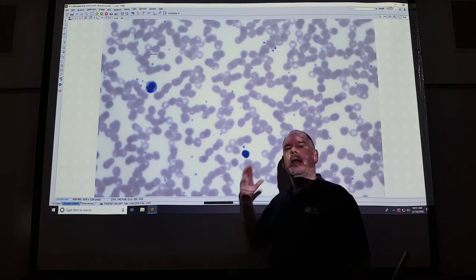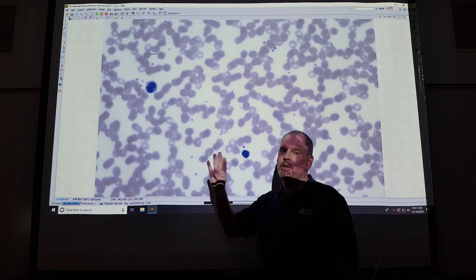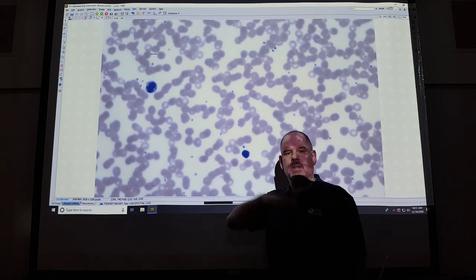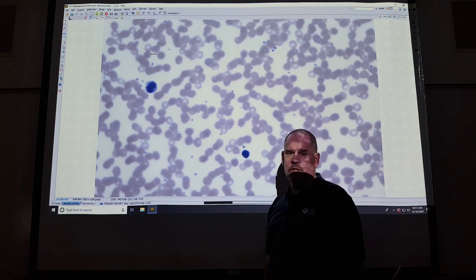Common mistake. I will ask a student, what type of tissue is this? And they will say blood. Blood is not a tissue type. Remember, there's only four choices for that: epithelium, muscle, lab one; connective and nervous, lab two. So this one is a connective tissue.